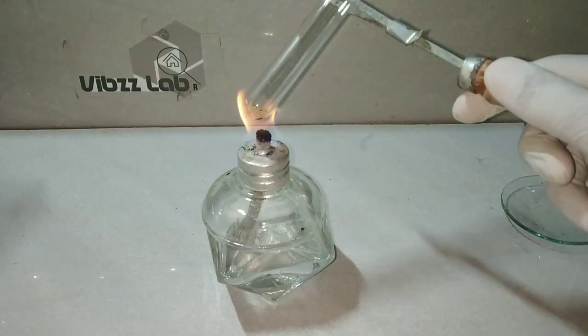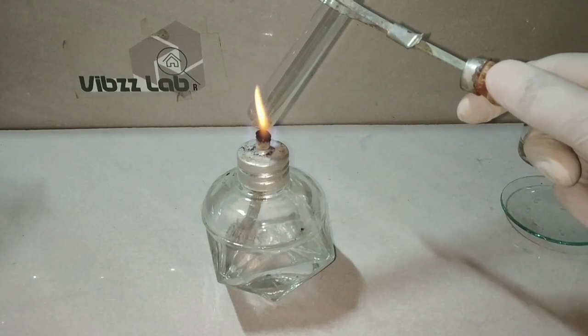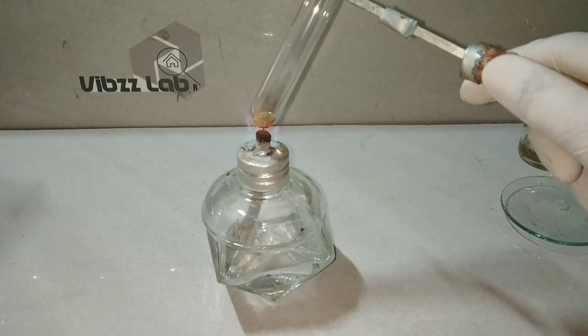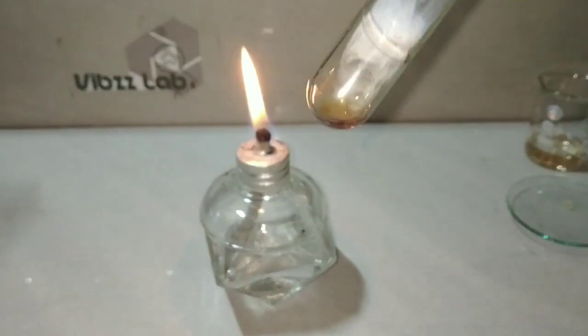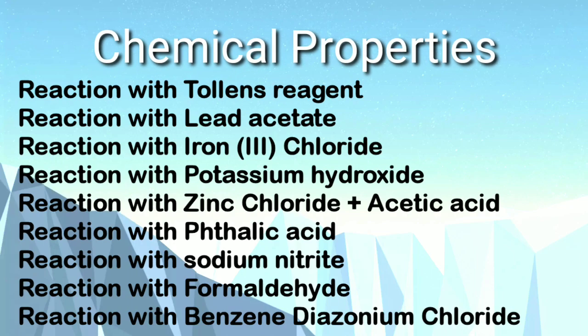Now we will be heating a little amount of resorcinol in a test tube, and you can see that on heating the test tube, the resorcinol has liquefied. Now we will be learning all these chemical properties of resorcinol one by one. You can pause the video to see all of them.